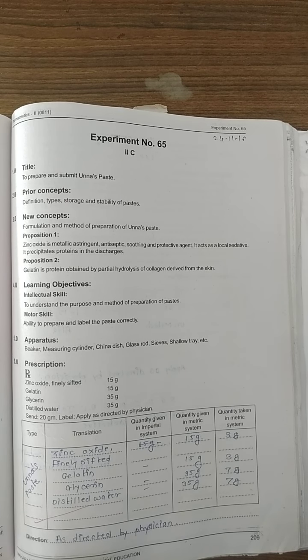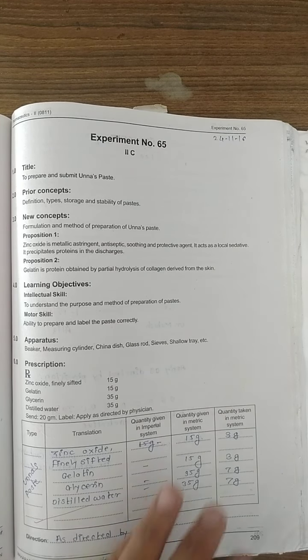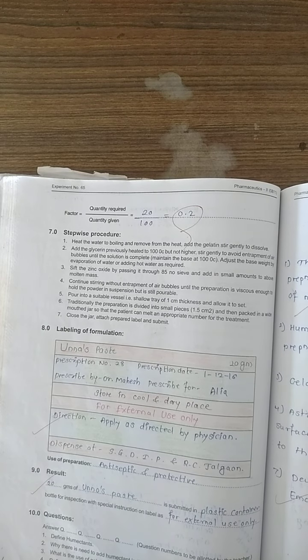Zinc oxide acts as a metallic astringent — meaning it is antiseptic, soothing, and protective. It acts as a local sedative agent. Now here is the procedure.